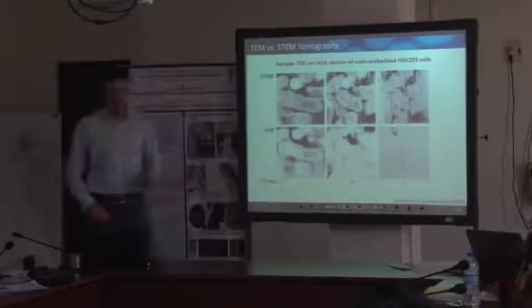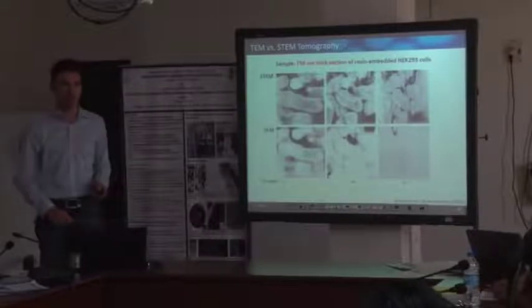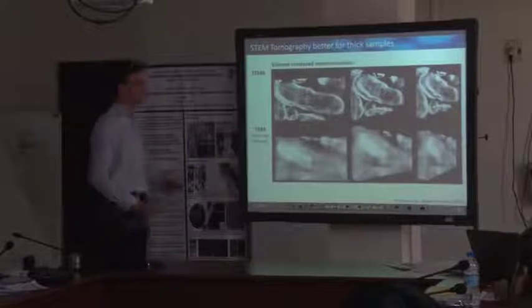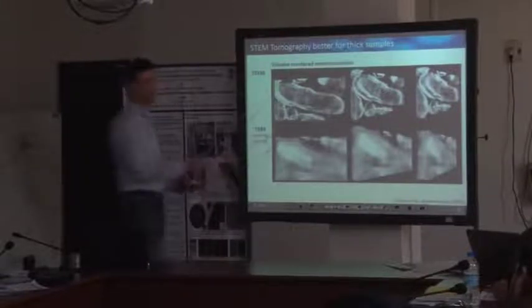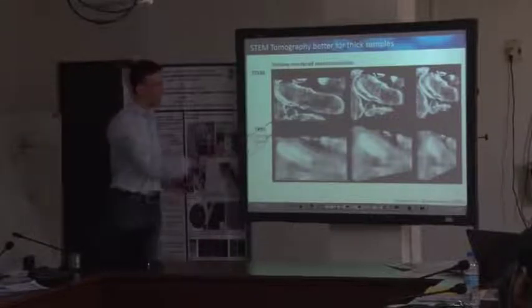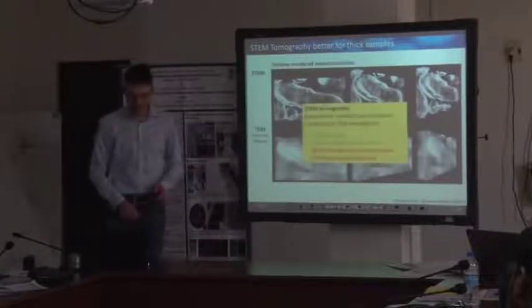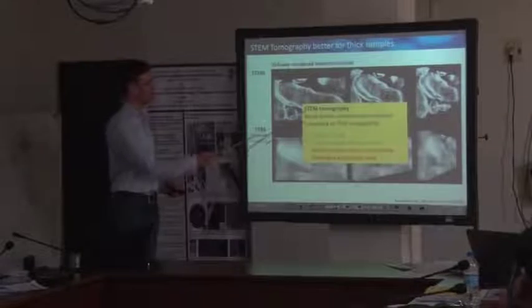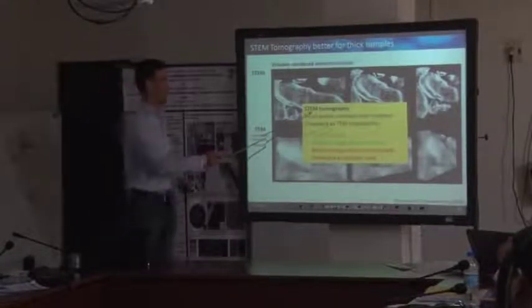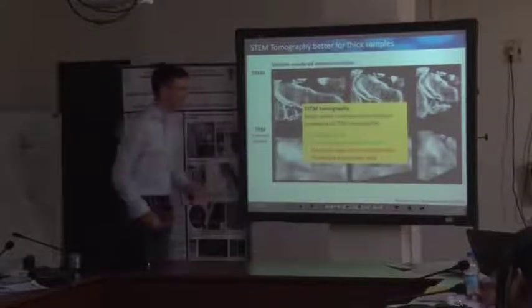So this is why for thick samples, in particular at lower densities, you prefer STEM imaging. And I don't have to go into the details why the final reconstruction looks far better than via TEM data. So this is the big advantage of STEM. Imaging in principle provides higher contrast and finally better resolution for thick samples.